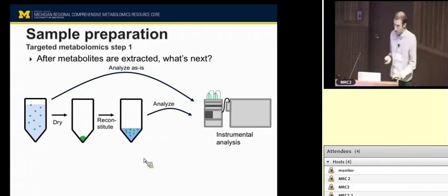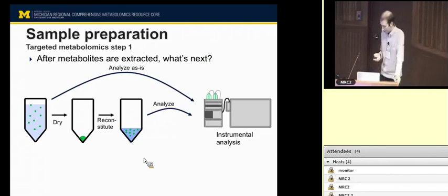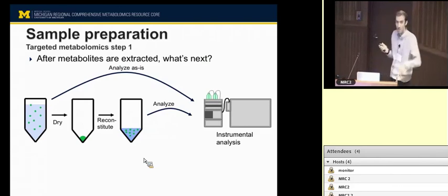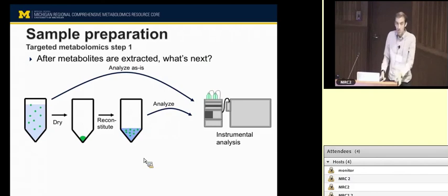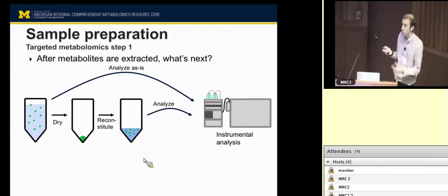Okay, so metabolomics workflow, simplified. I showed you the circular sort of slide. Now let's take it in steps. And I think importantly here, since this is a metabolomics core, a lot of the times, depending on how you're going to do your study, you may not do every step of the experiment that we're going to tell you about. So it's good to define who does what in a typical core user sort of study.